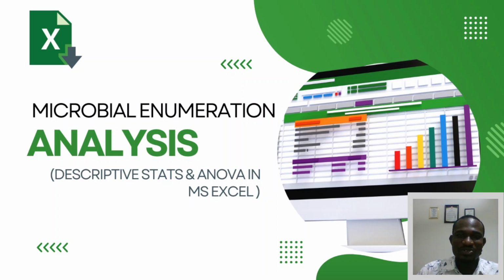In today's video, we'll be exploring how to analyze our data using Microsoft Excel. And as a food microbiologist in training and in practice, I'll be using microbiological data. And so this is specially dedicated to students in KNUST who have had the privilege of working on any microbiology related projects and they have to analyze their data.